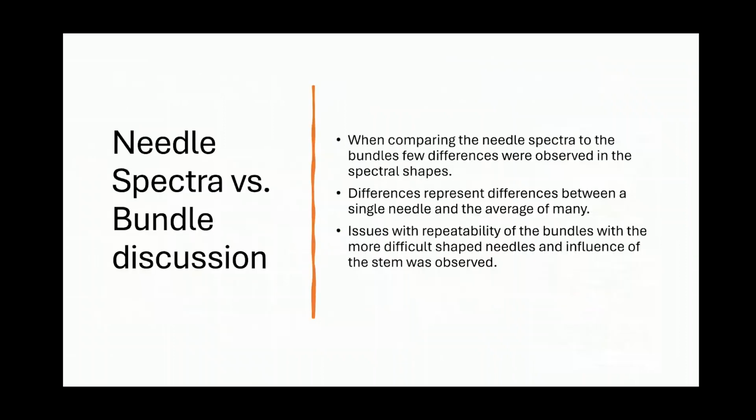So in summary, we can collect more targeted spectra despite the reduction in signal. The spectral data is of the same quality using the NaturSpec, and it is easy to identify differences between the groups. In some of the individual needle spectra, using the lower resolution instruments, there was some loss of signal, but it's able to be overcome using the higher sensitivity instrument.